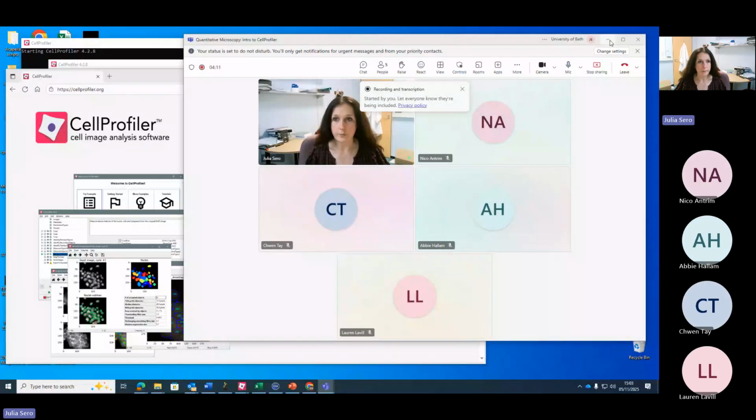Introduction for getting started with CellProfiler. CellProfiler is a tool that was made by biologists together with computer scientists, probably originally made for analyzing cells in 2D culture under the microscope, but can be used for all sorts of other things. There's a whole worm toolbox for nematodes, and the principles of image analysis that it uses can be applied to all sorts of different things.